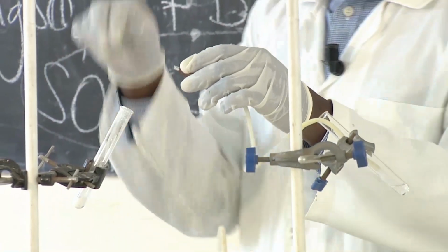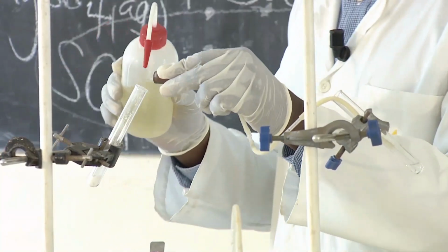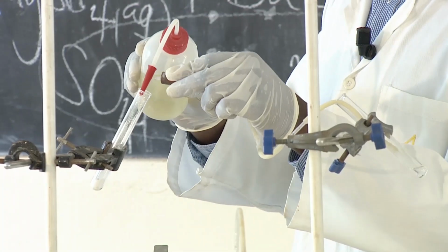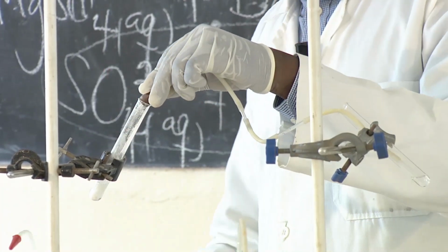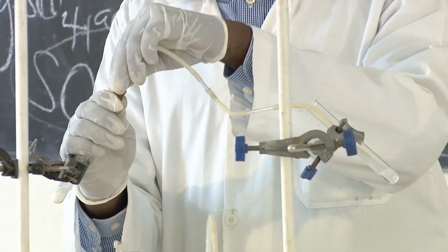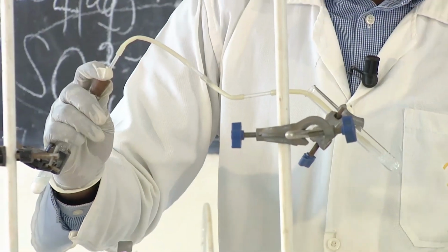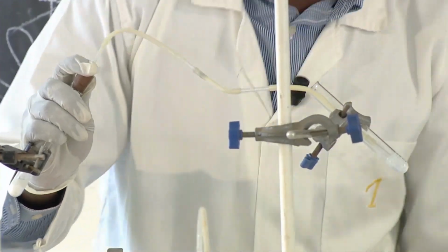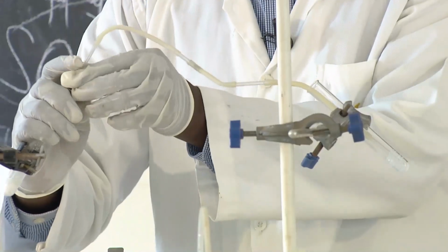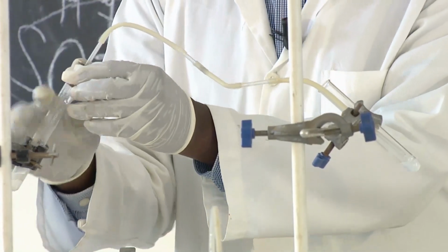So that means we are basically using calcium carbonate reacting with the acid. So this is the acid. So we are adding the acid. You see the gas passing here. This is effervescence, as I've said. A milky solution is forming. So we need to pass more gas.